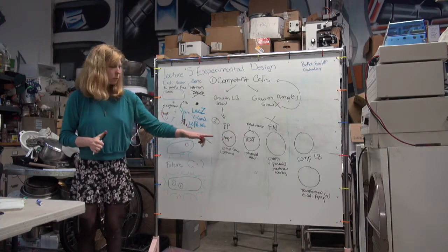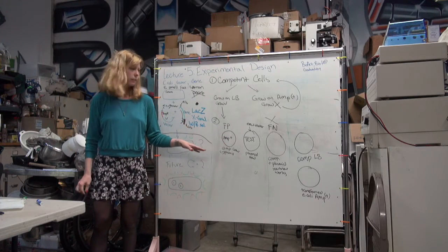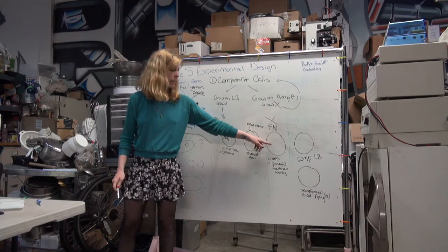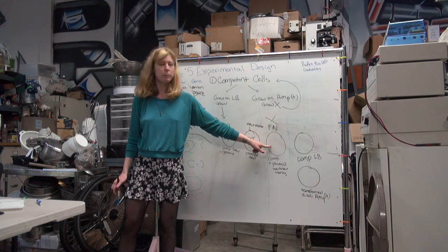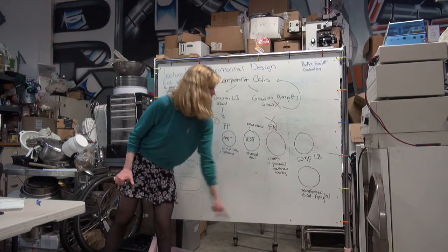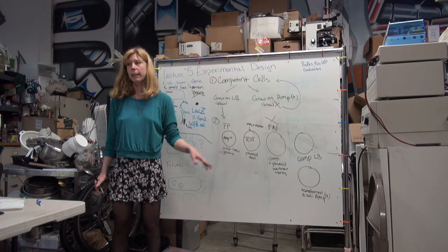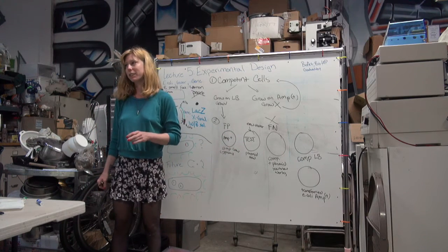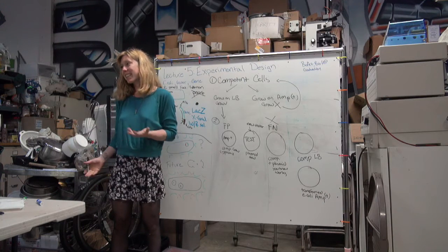Including that plate will ensure that you didn't put too much ampicillin, right? So this one here tests whether your transformation protocol didn't kill your experiment. This one here tests to make sure that the ampicillin was at the right levels so that an organism with the ampicillin resistance cassette could grow, right? Because that could be a possibility.